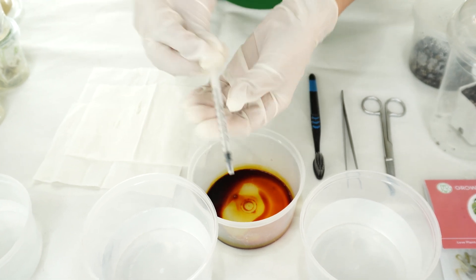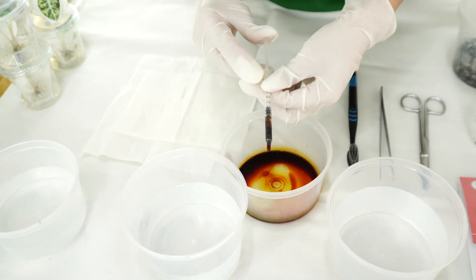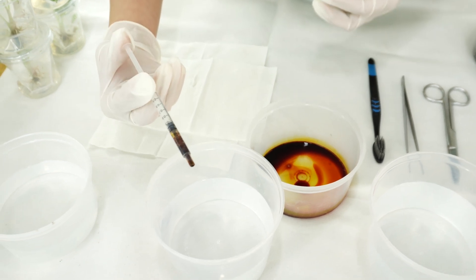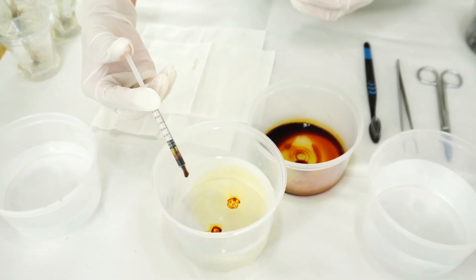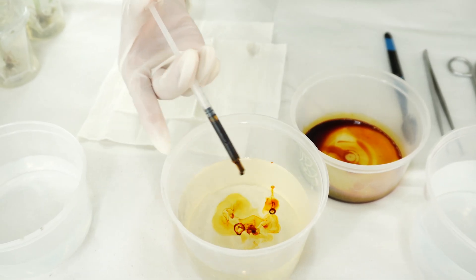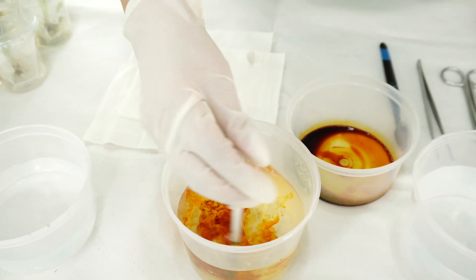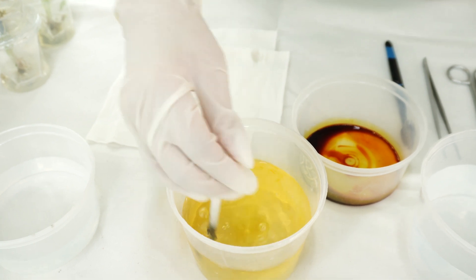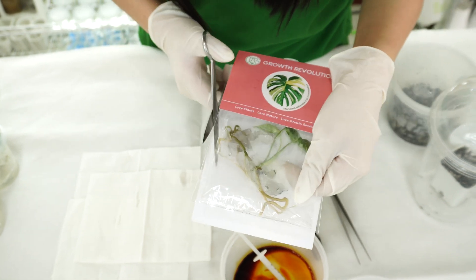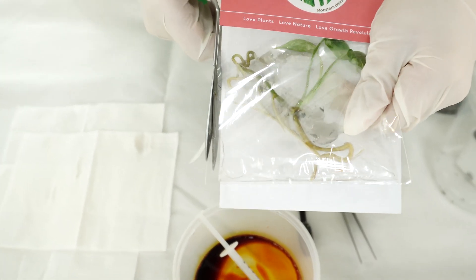Now we're going to mix the iodine with the water. We don't have an exact amount, so we just drop a few drops of iodine into the water we have prepared. Take a look at the color — the water is going to turn a little bit yellow, which means it's good enough to disinfect the plant.